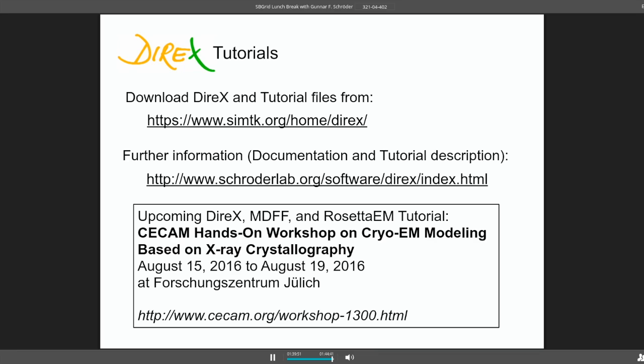I do have one question, though, and I apologize if this is something that you mentioned. Is it meaningful to compare C-free versus C-work? Does that give you anything useful? Not at the moment. The problem is that you're calculating this from different Fourier shells, and they are not comparable. Typically the C-free value is always much lower than the C-work value.